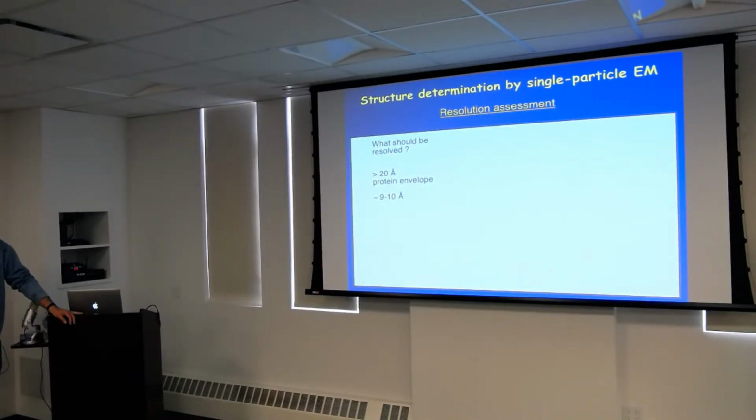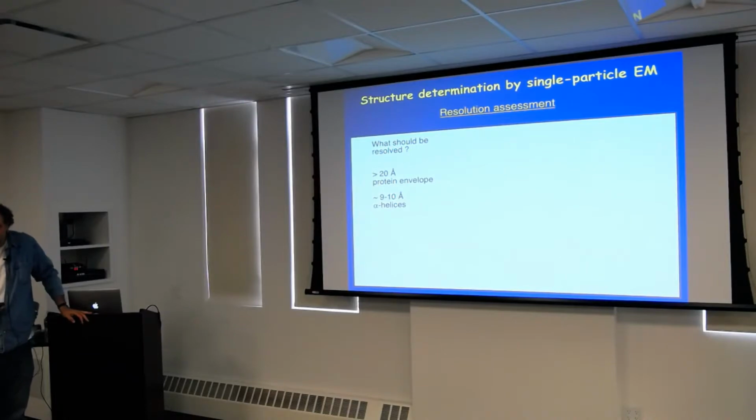A secondary structure? Yeah, sure. I mean, yeah, helices. Okay, helices. Yeah, that's what I mean. I said peptides. If you get a certain bond type pattern, then you get.